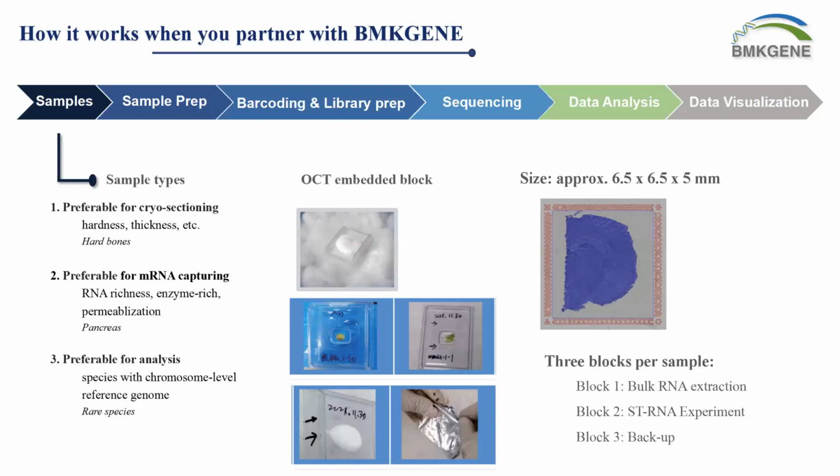And in terms of the sample preparation, we always recommend to have backups and to have more biological backups so that we can perform several rounds. Especially in our process, we need one block to do a bulk mRNA extraction and another block to do the real spatial RNA experiment. And we always want a backup sample.